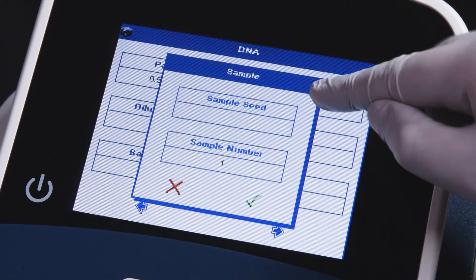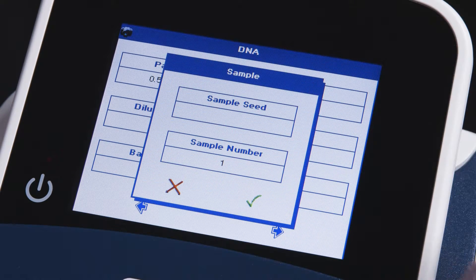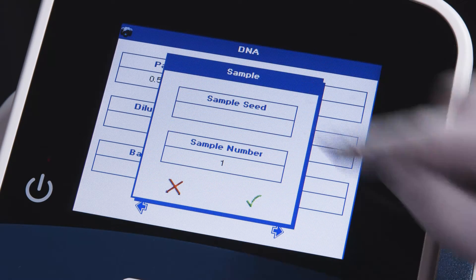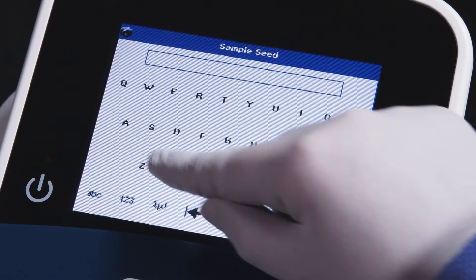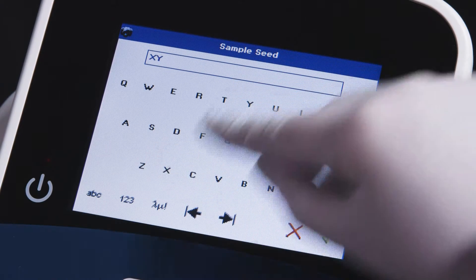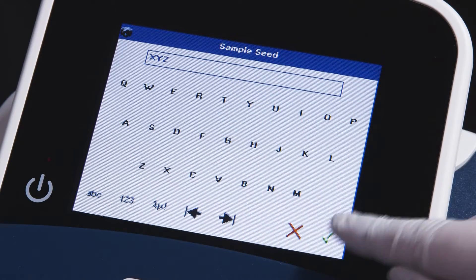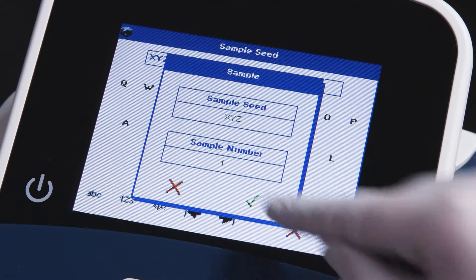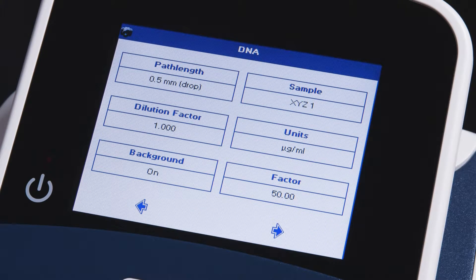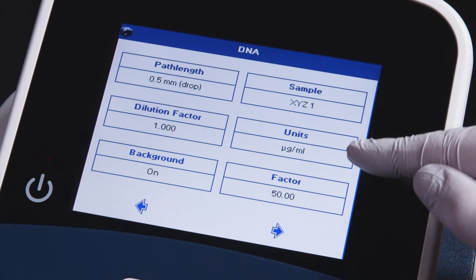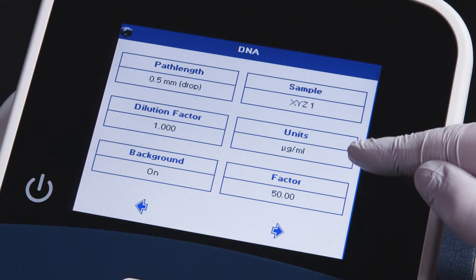In the sample option, you may set your sample seed. For this example, we'll call it XYZ. All samples will begin with XYZ and proceed with an incremented numerical value.